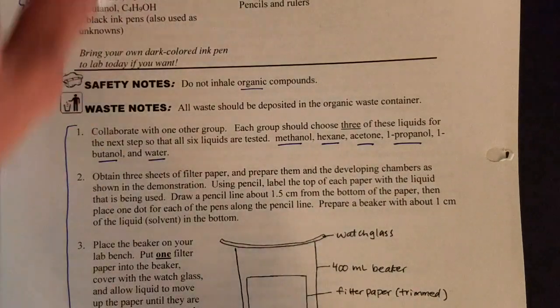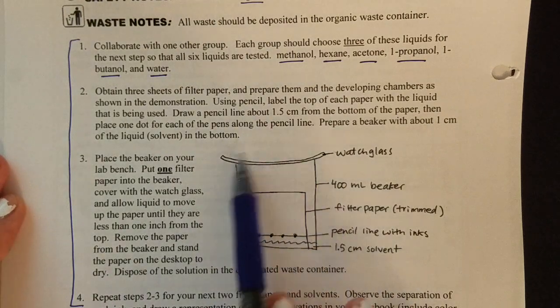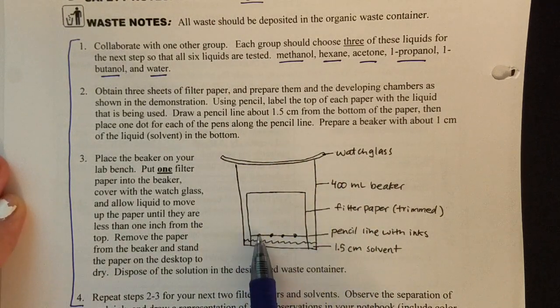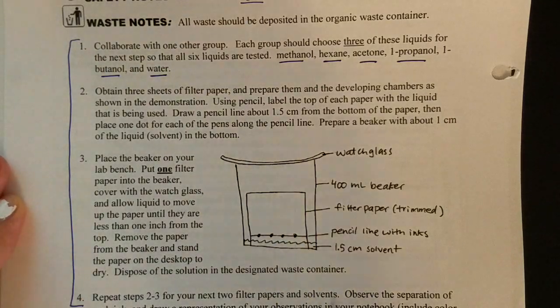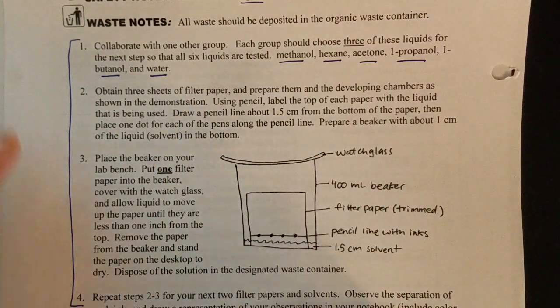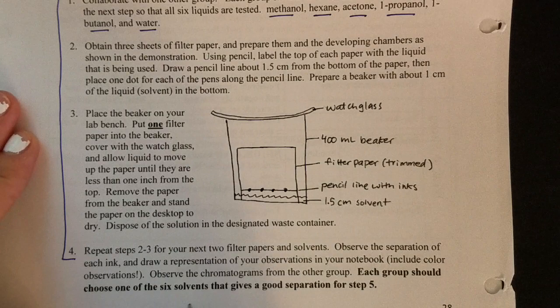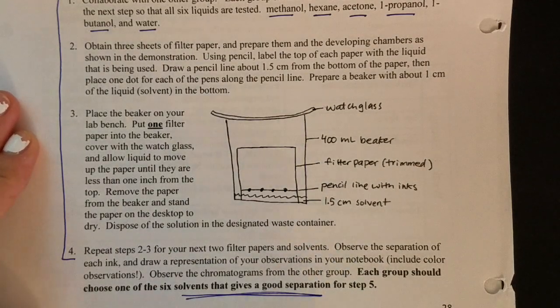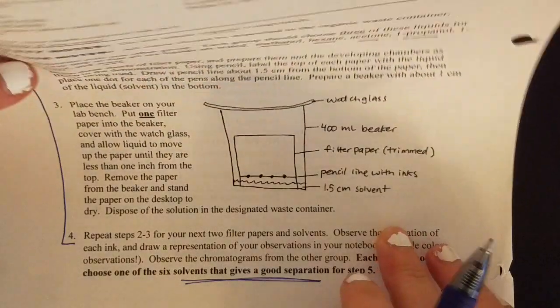So you'll see in the video that this is going to be the setup like I sketched for you earlier. We've got the solvent at the bottom. We've got the ink spots and that solvent is going to move up. And you'll see kind of in a time lapse what happens to each of those inks. After we've done steps one through four, then we will pick a solvent that gives a good separation. In other words, makes the three inks look very different from each other. And that will bring us to the next page.